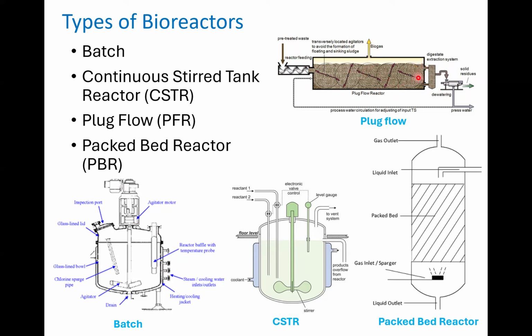And while it's traveling, you can also have material that becomes more stable, or has different characteristics, or the product can be collected at the end, depending on the materials that you are treating. Sometimes if you are producing chemicals, while the material is traveling, it's reacting with enzymes and bacteria or archaea, and by the end you can collect the products.